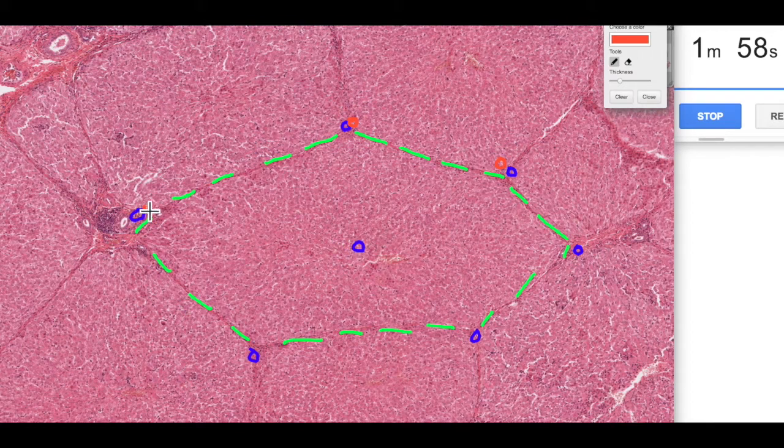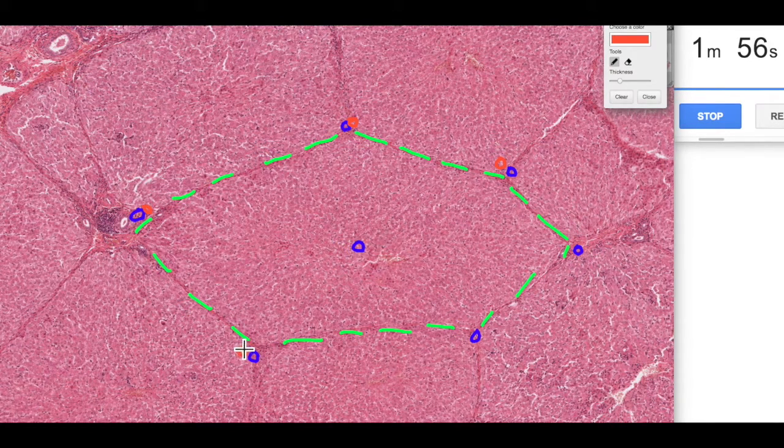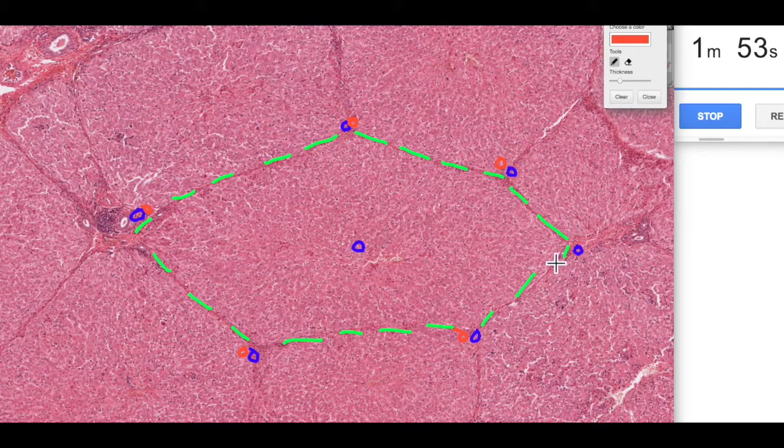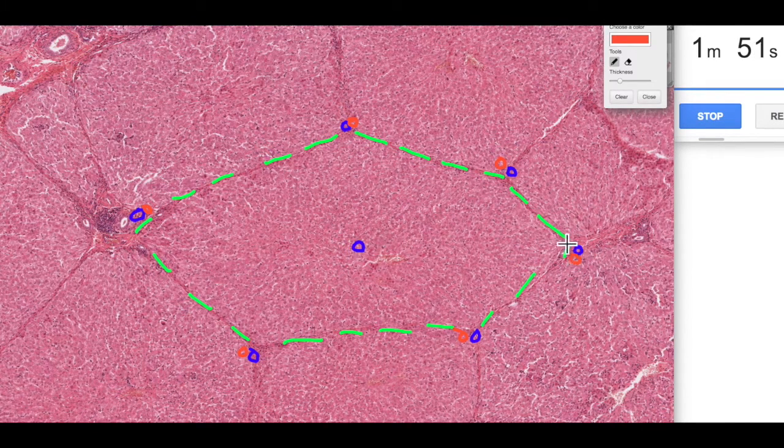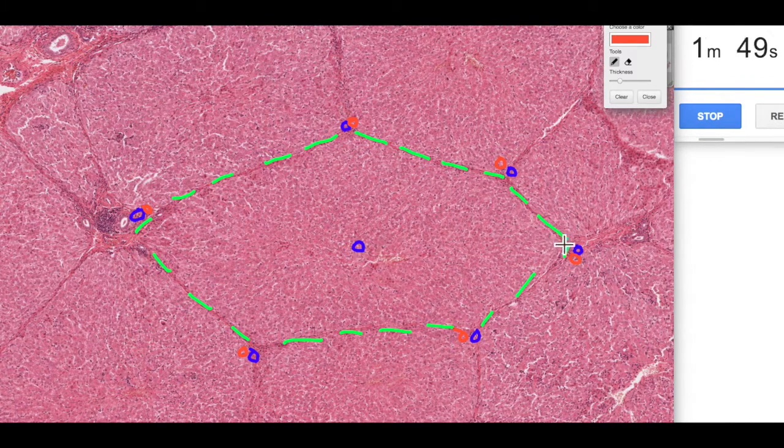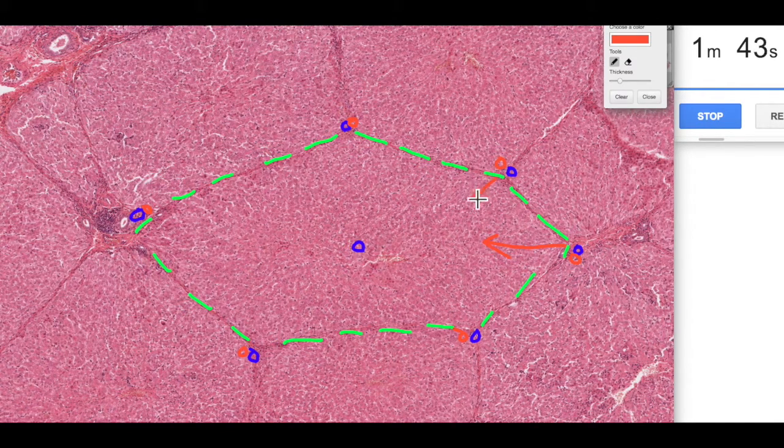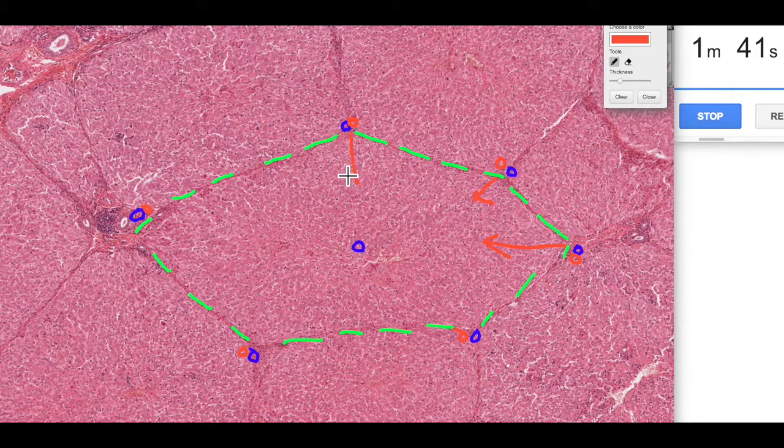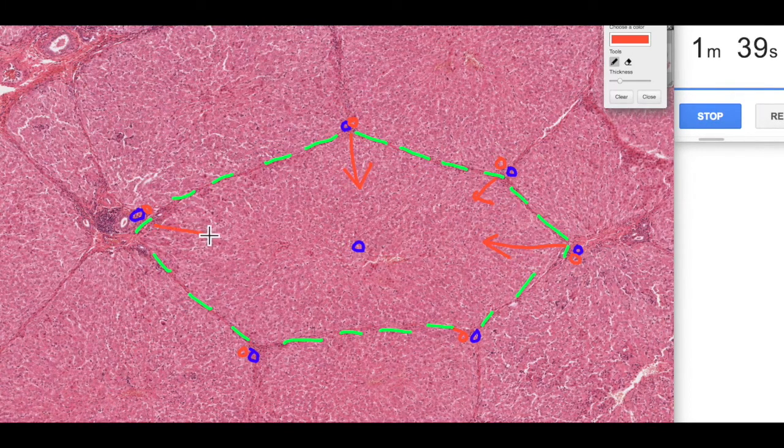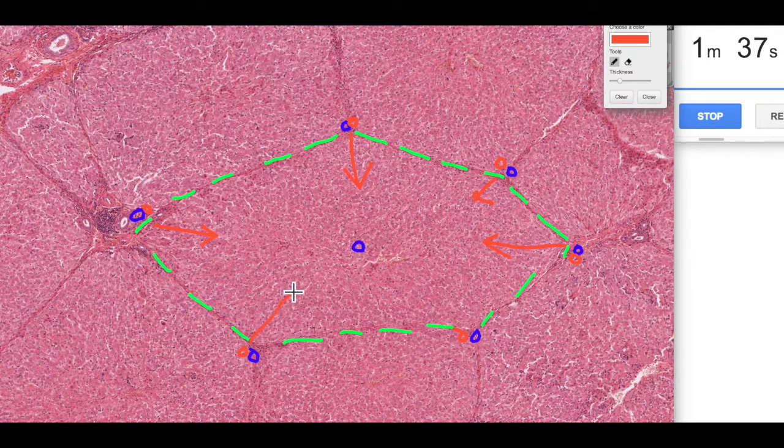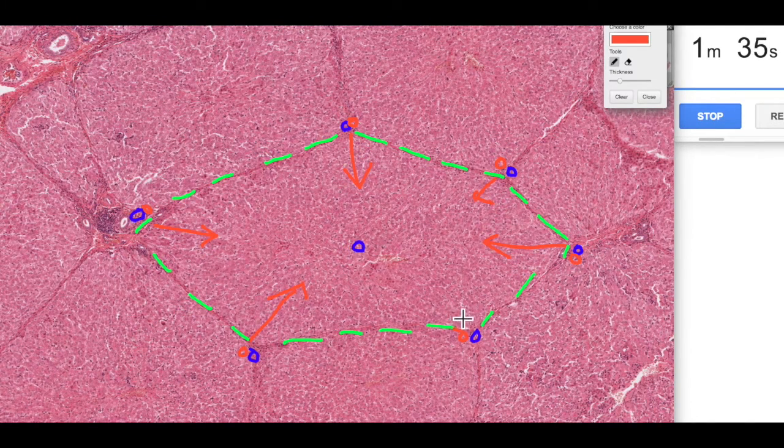They exist within the same portal regions, the portal triads. The idea being that the blood supply pools for that dual blood supply and then eventually drains into this central vein, all percolating through these liver sinusoids and eventually draining into our central vein here.